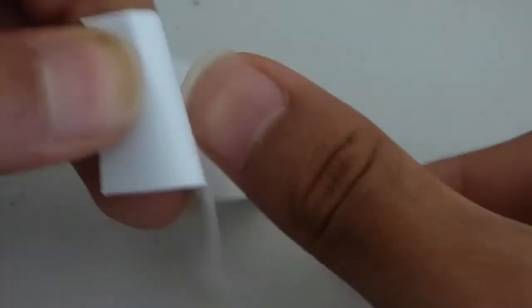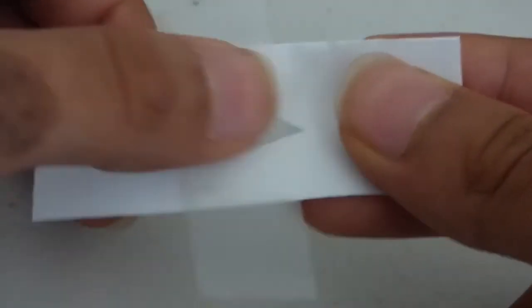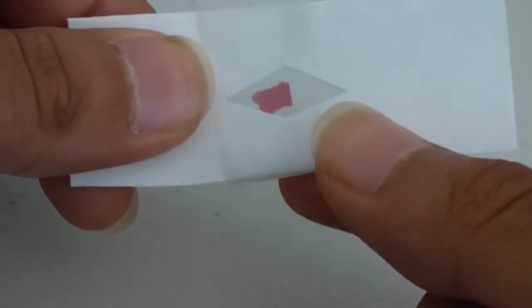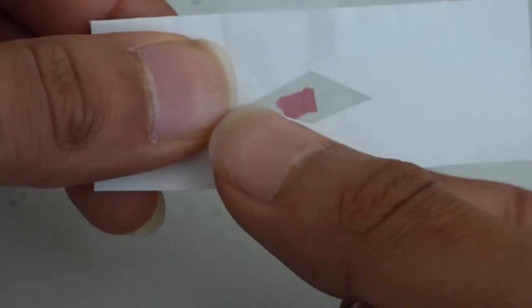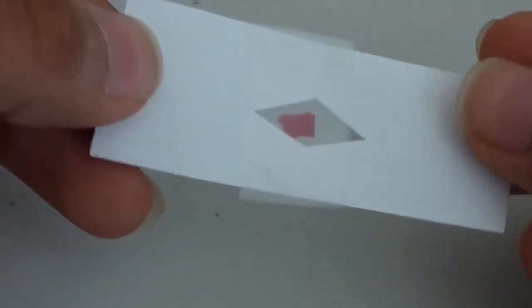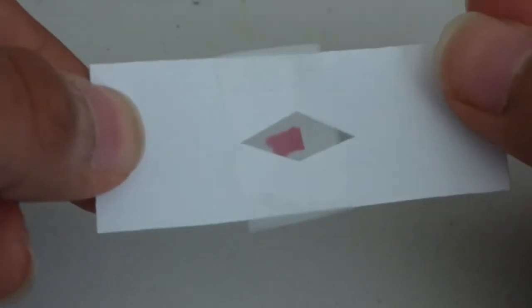After we get it in the right position, we're going to take another piece of tape to close it off. With that, our sample is ready.